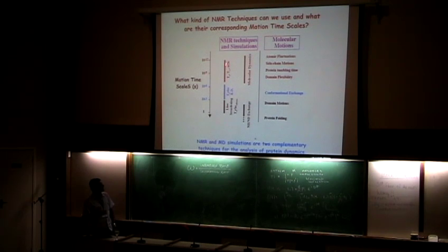By using different pulse sequences and different techniques, especially in the last 5 to 8 years, one can use isotopic labeling and get information from around the picosecond time window to even the microsecond time window, so one can explore all that. Of course, there are a lot of drawbacks with NMR techniques. One of them is protein concentration, since a lot of the proteins start to aggregate sometimes. But anyway, one can look at all these motions, from atomic fluctuations to protein folding, by using NMR.